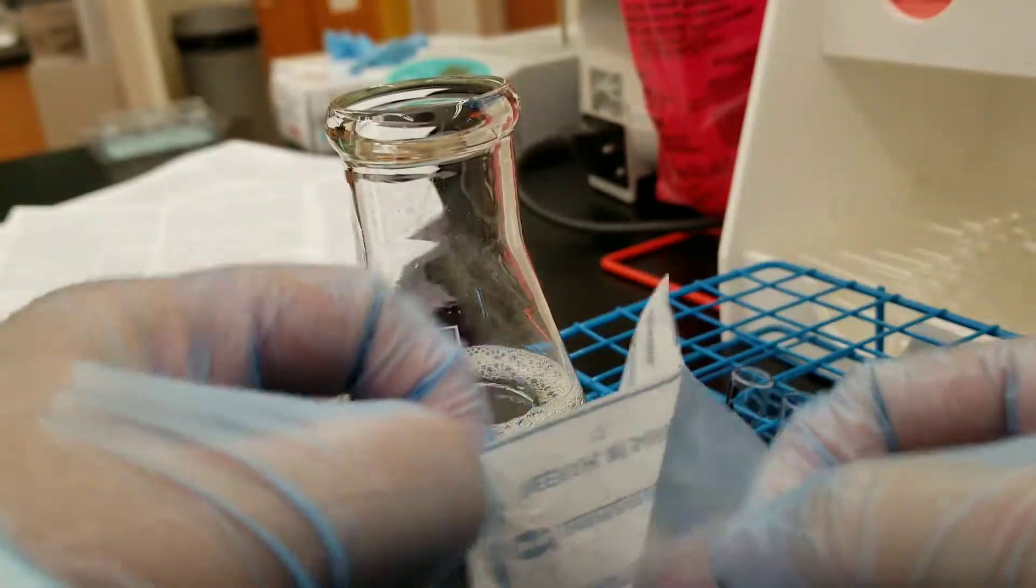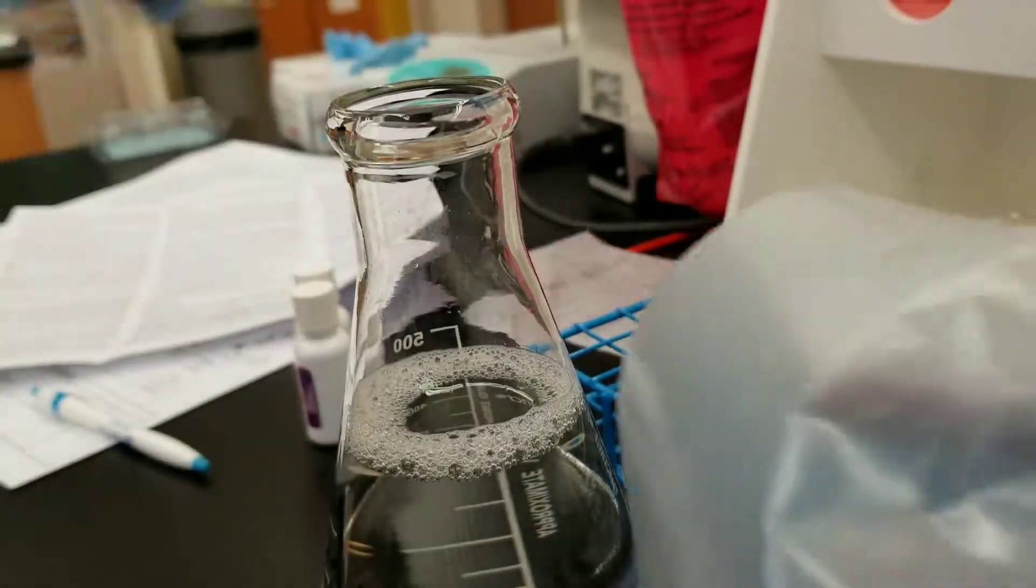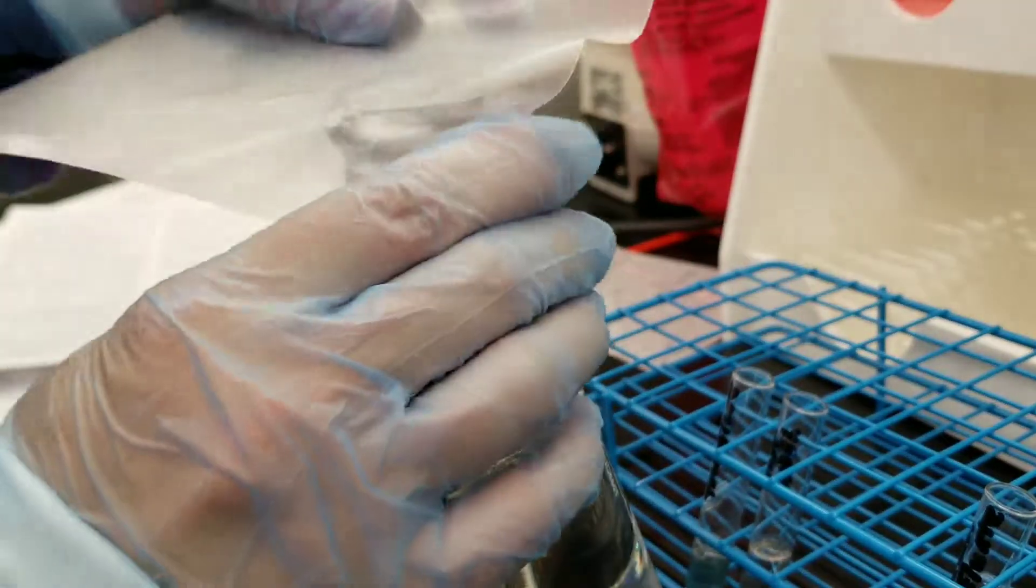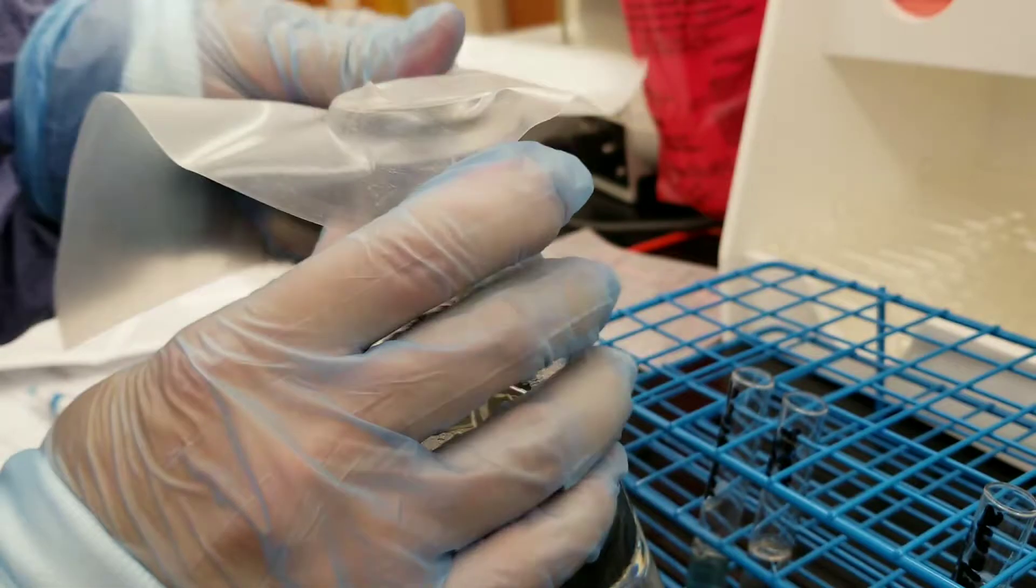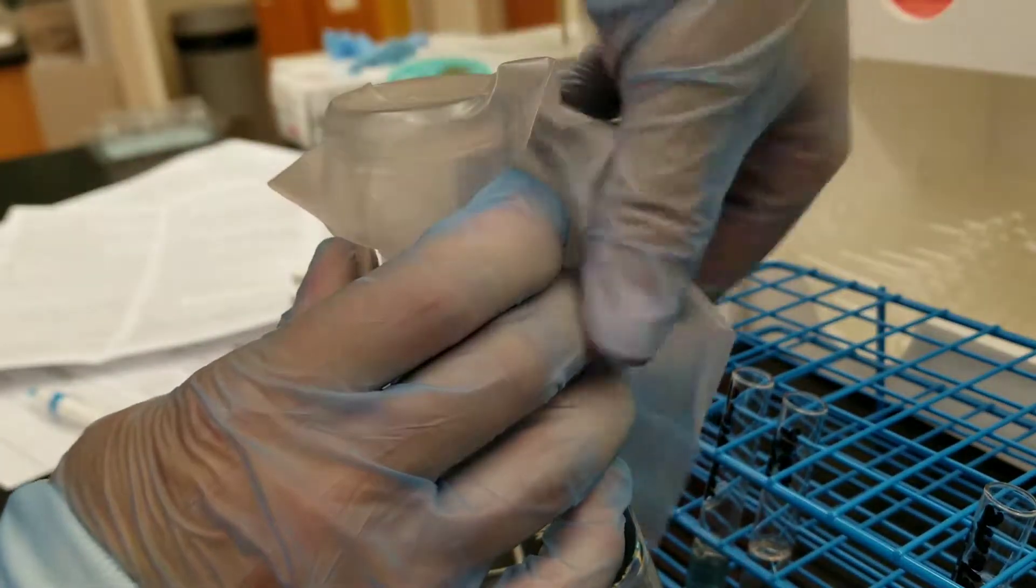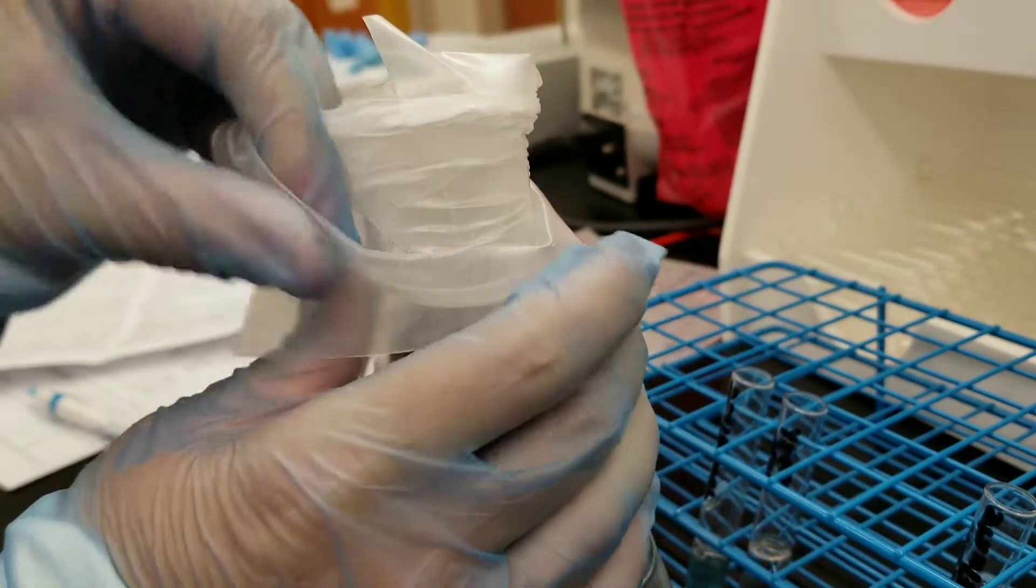So this is the working wash solution that we made in the elution video. You just hold it down, stretch it across and wrap it around.